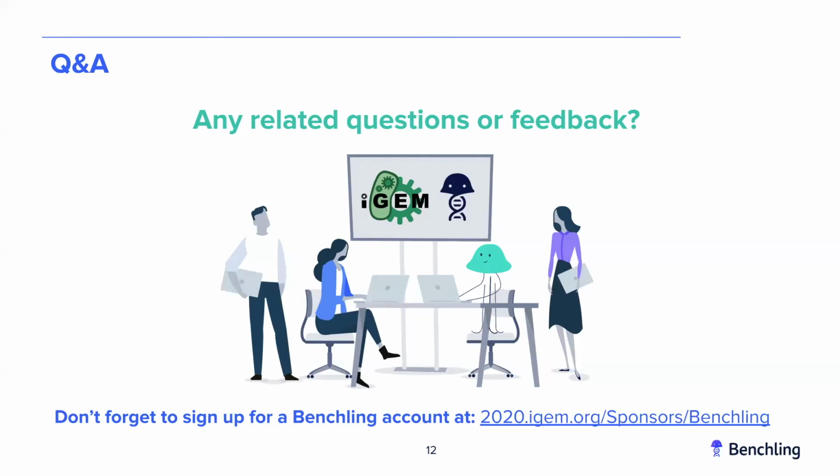I have a few more questions. What criteria do we need to use Benchling's free academic version? Maddie, do you want to take that? I guess maybe they're asking about hardware specs or software specs. There are none that I'm aware of. One thing I will say is if you're trying to associate with an academic institution, we highly encourage you to use your academic email, but you can also sign up with a Gmail account. I don't know if there are any specifics for iGEM, but I know you can use whatever email you want.